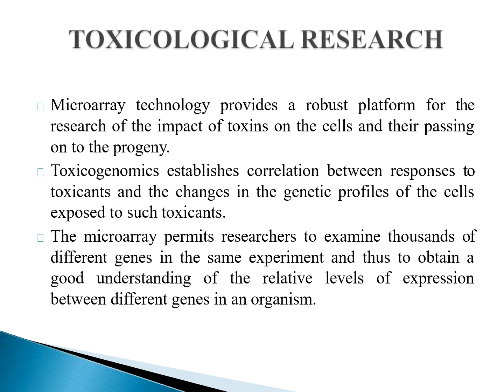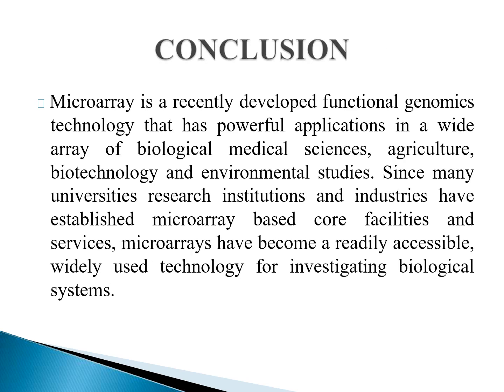Again, like in the case of cancer cells, you can take two different samples: one is control and the other is treated. In the control, you do not expose the cells to any kind of toxicant, and in the test sample, you expose them to the toxin molecule, and then you analyze how the gene expression pattern changes after exposure to the toxin. Thereby we can analyze thousands of genes at a time and find out the candidate genes which are responsible for the response against the toxin.